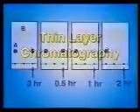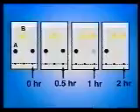The most common method for monitoring reactions is thin layer chromatography. Abbreviated TLC, it is used largely as an analytical technique for determining the purity of materials and for preliminary identification purposes. TLC requires very little sample.